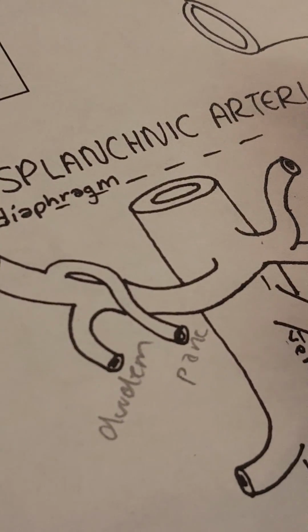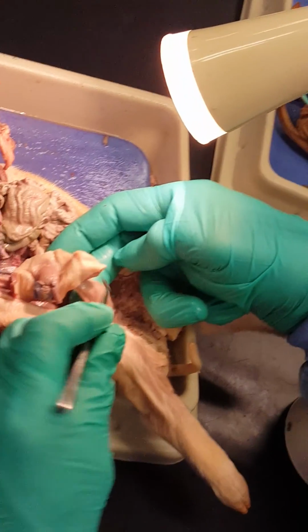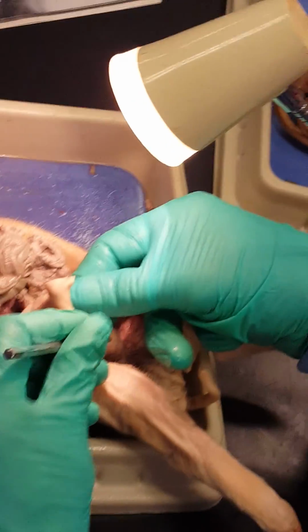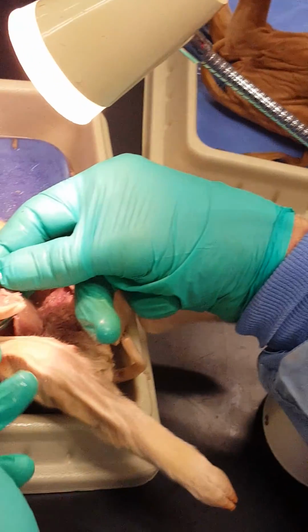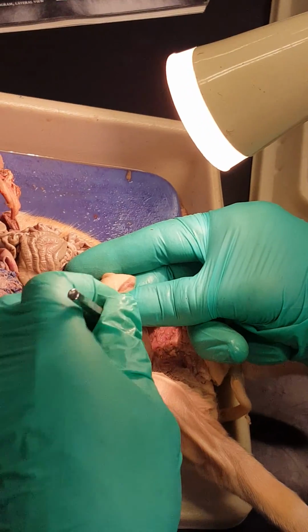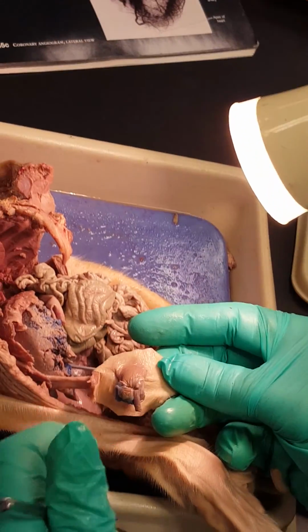Now, down here in the fetal pig, there's another important pair of arteries that come off the dorsal aorta. And they're running up here, just flanking a hollow vessel, which is the urinary bladder. Okay. And they're running up into this.